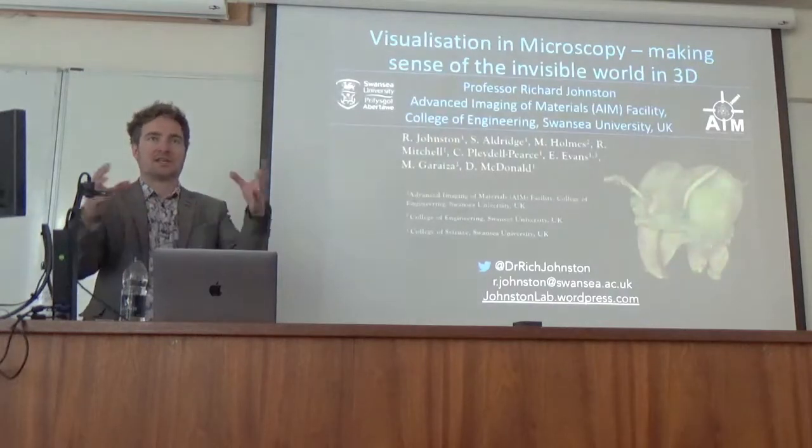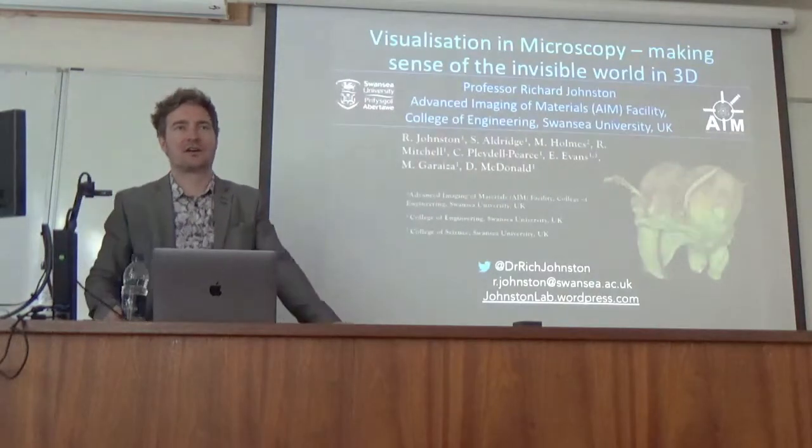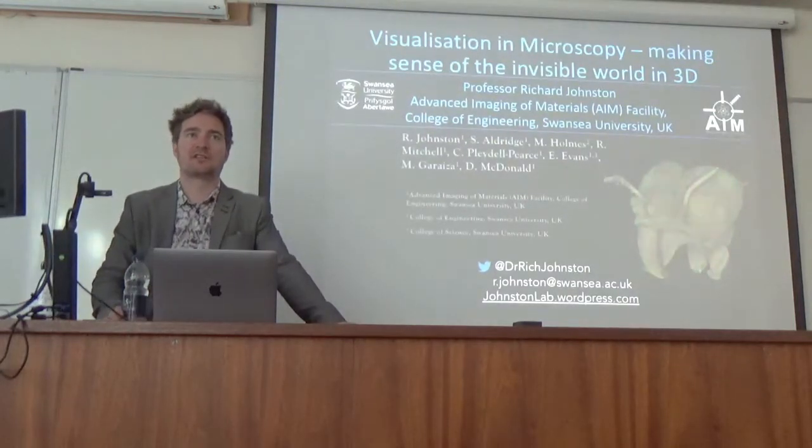our kind of walled data sets where we've set the thresholds and the lighting and things beforehand. So that will actually be quite useful because you can do measurements in that software as well.